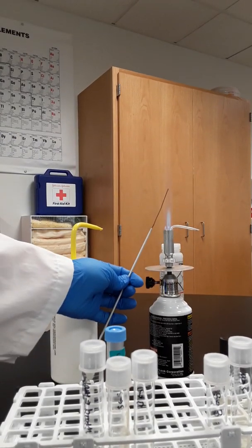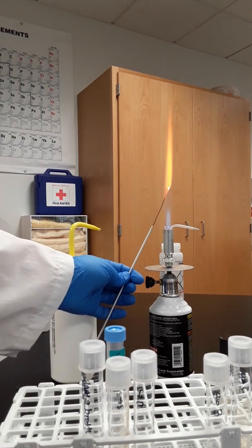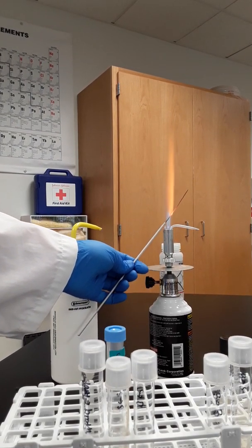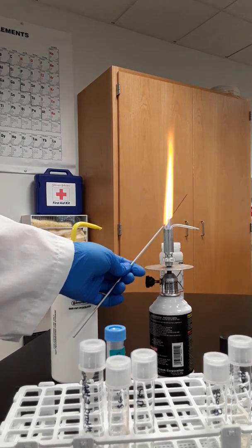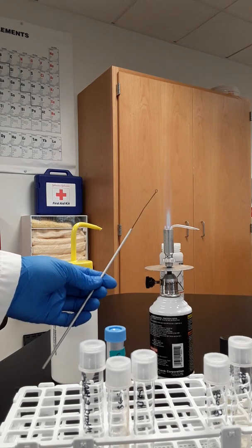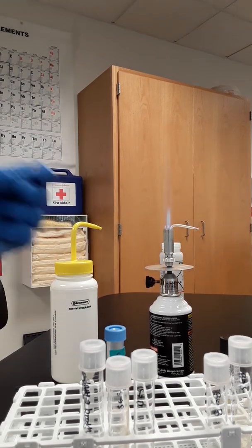You want to make sure that it's orange all the way down the handle, all the way down the wire. The handle's not going to heat up, and you want to make sure that it's red hot. As soon as it's red hot, it's done, and then you've got to wait 20 seconds.